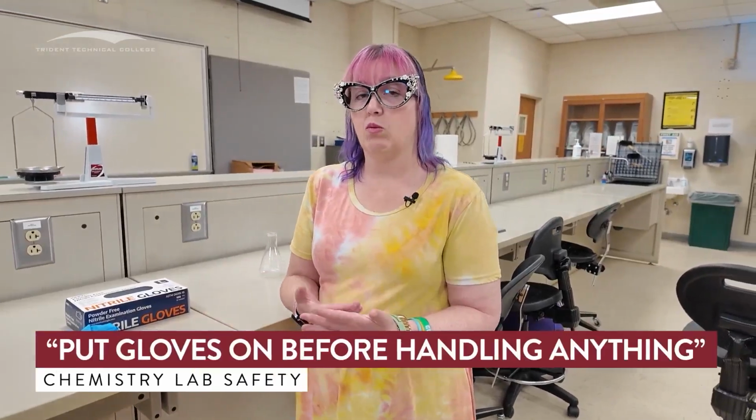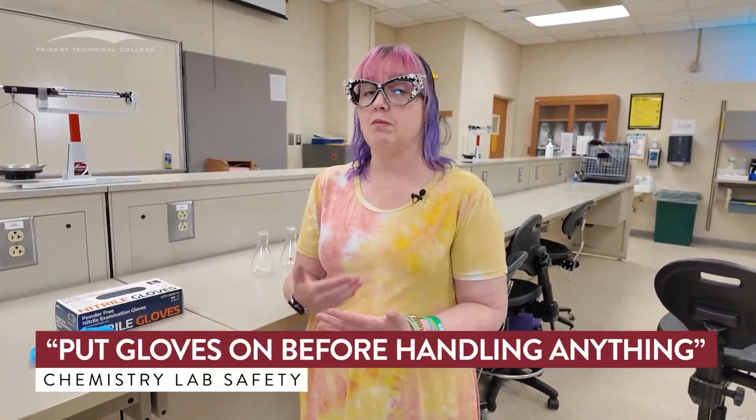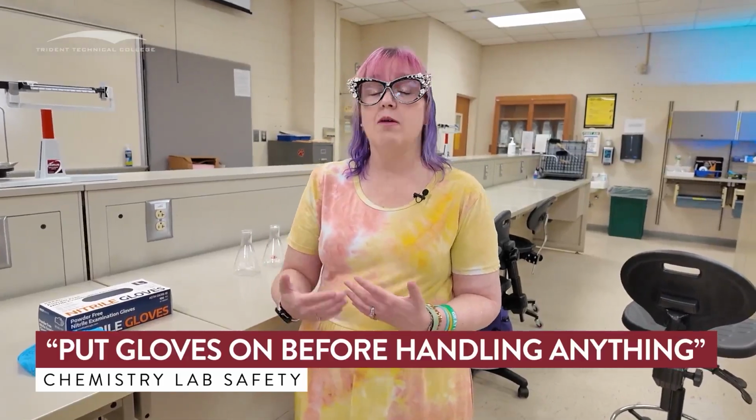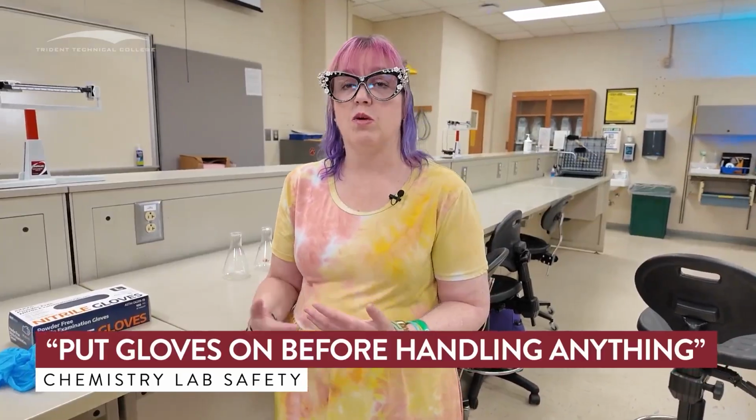We put those gloves on before we handle anything, because you may not be the first lab for that week. So the things that we're dealing with may not be as clean as we want them to be. So we want to make sure that we're dealing with everything in gloves. Anything that we deal with in the lab needs to be done that way. Anytime anybody is working with anything, doesn't matter if it's chemical or not, for those labs, we need to be wearing those gloves, okay? So I think that's everything I need to talk about with the gloves.